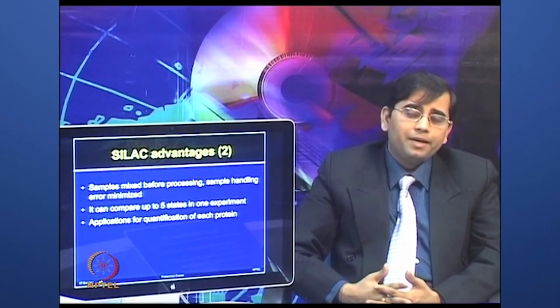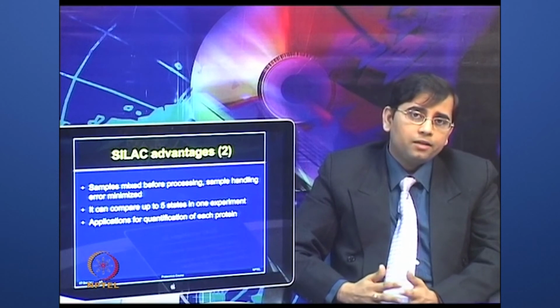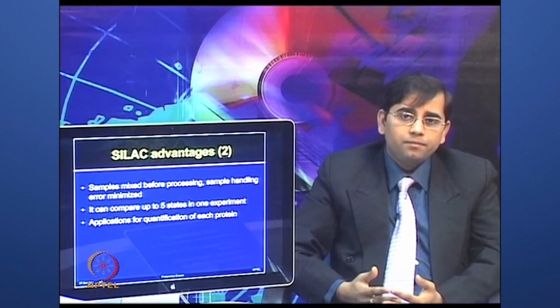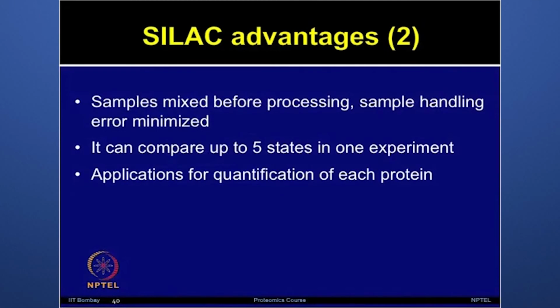So, samples can be mixed prior to the processing before doing the mass spec analysis. So, this method eliminates some of the handling errors. Now, SILAC experiments have demonstrated that it can provide the 5 plexing capability to compare 5 different states in one experiment. So, there are various applications of quantification of proteins by using the SILAC method, which we will discuss in the next few slides.